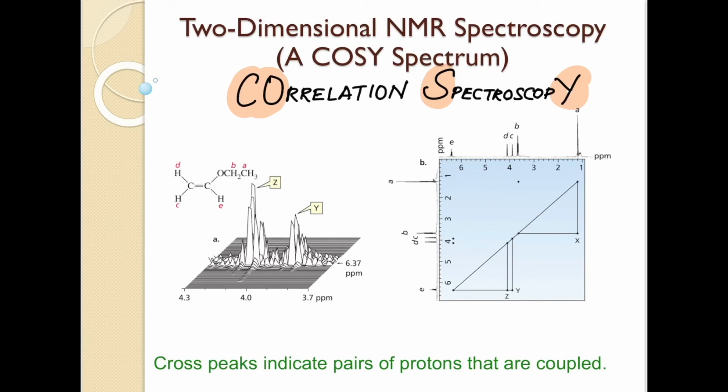So as soon as you get the spectrum from the correlation spectroscopy, you are going to drop a diagonal across the spectrum, and the points which are lying away from the diagonal are said to be the cross peaks. And if you drop 2 lines perpendicular to each other, one parallel to the y-axis and the other parallel to the x-axis, then you will be able to reach 2 peaks, and these 2 peaks represent the 2 protons which are coupling with each other.